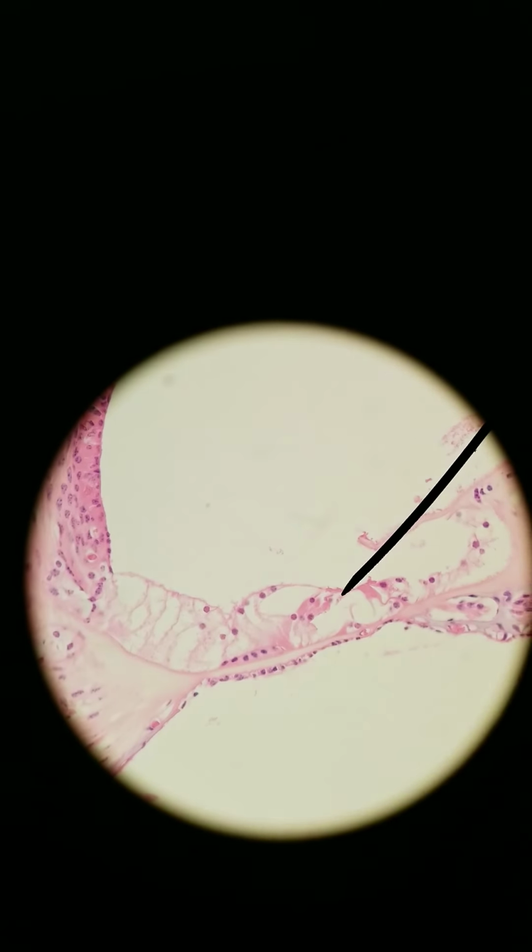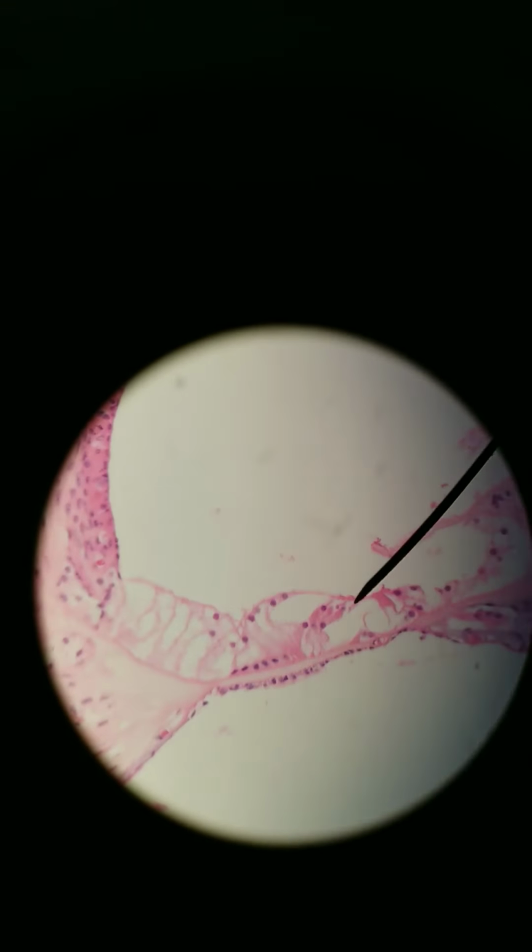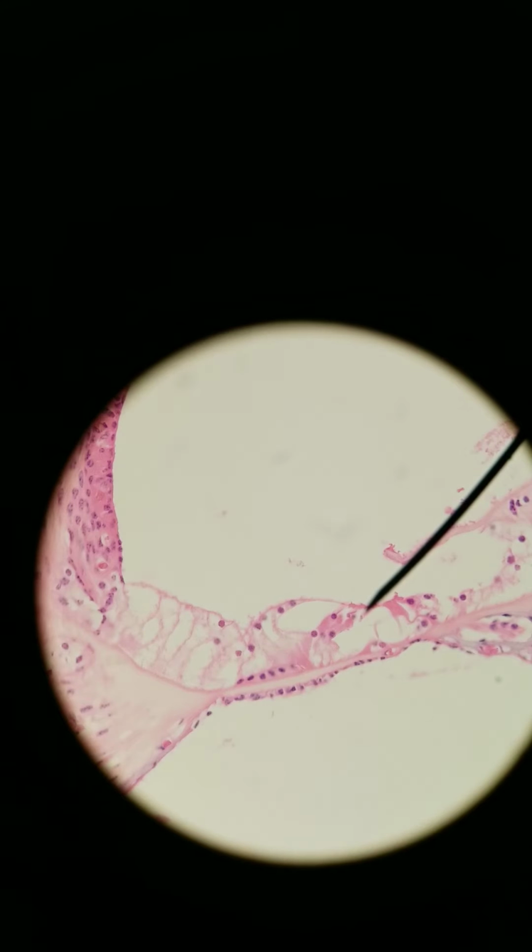Hair cells are special receptor cells. And when they get activated, they then activate a sensory neuron that relays along. It forms the cochlear branch of the vestibular cochlear nerve, cranial nerve number 8.